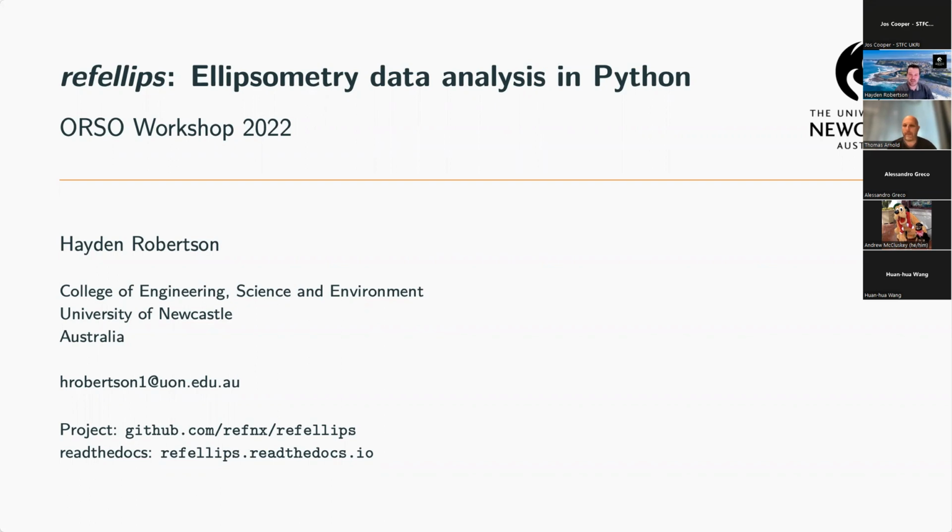My name is Hayden Robertson, and I am a PhD candidate at the University of Newcastle, Australia. And today I'm going to give you a quick rundown on some software that myself, Andrew Nelson from ANSTO, and Isaac Gresham from the University of Sydney have written, called Refellips, and it's for the analysis of ellipsometry data in Python.